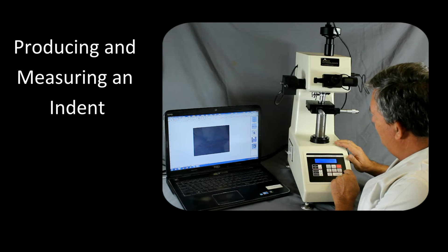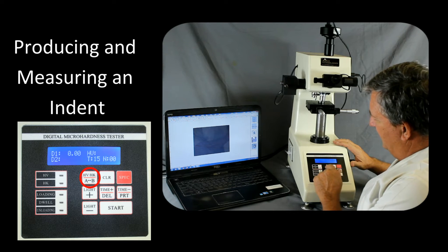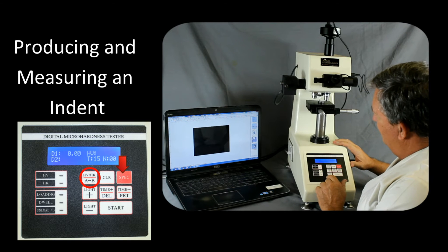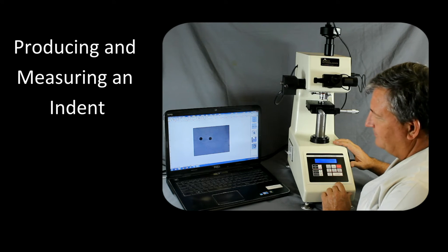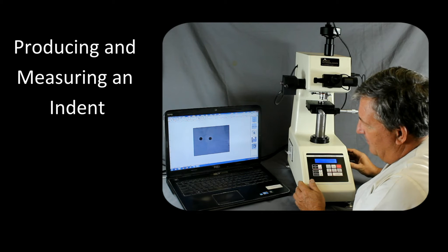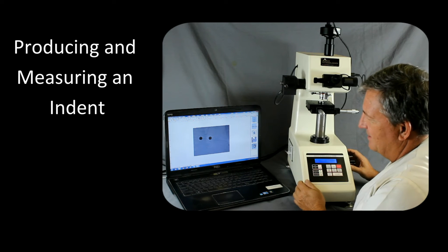To do that, we need to rotate the turret to the 10x objective. If you look on the upper left key, below the line it has an A to B. We want to hit the spec button, or the red button, which turns it to the indenter. Then spec A to B again will take it to the 10x objective. From there, we can go ahead and focus on the sample. One way to help is to rotate the micrometers a little — it's easier to see something that's moving.